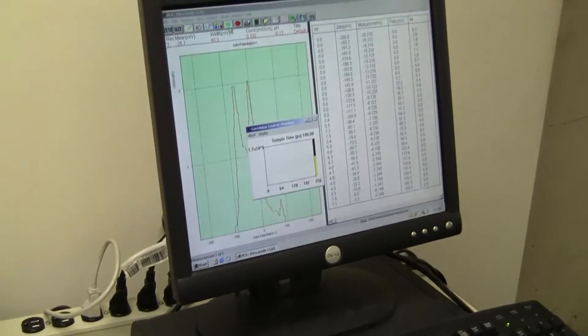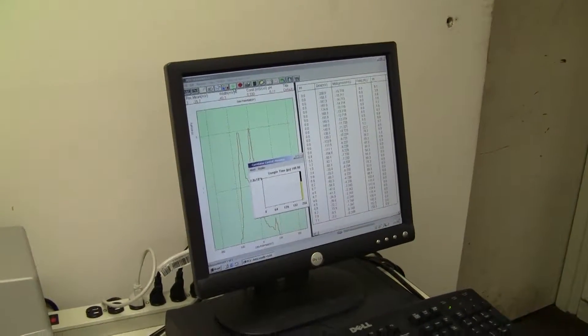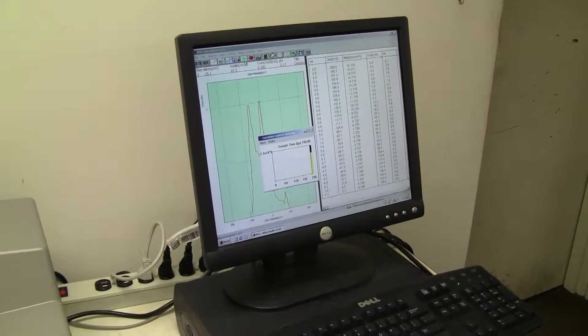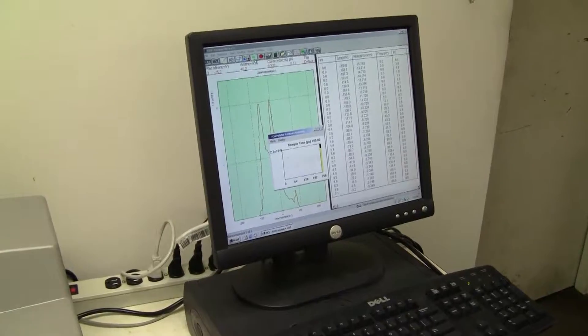We just started scanning, putting a fresh sample in. It takes a little bit of time, so please have patience with us.